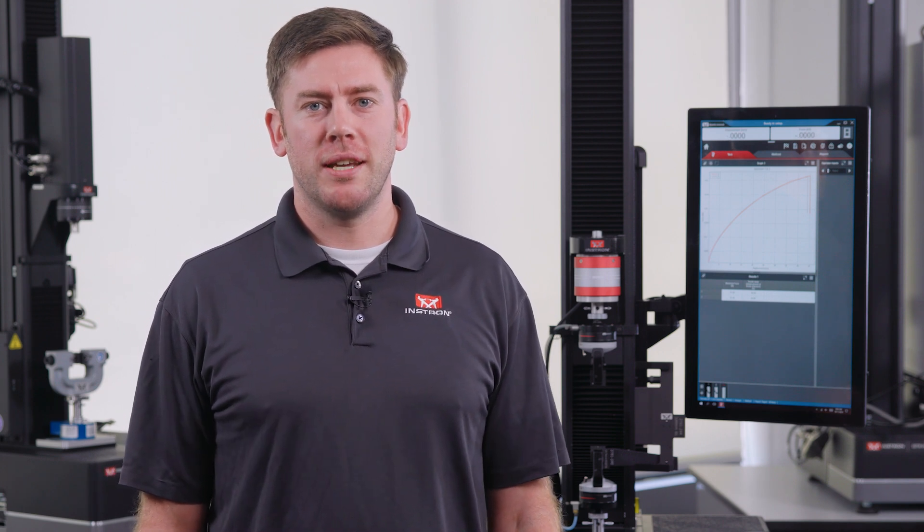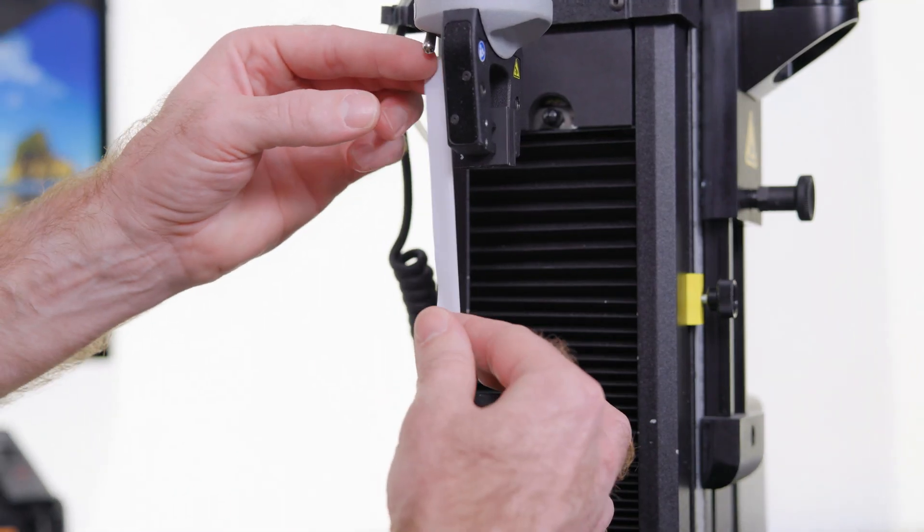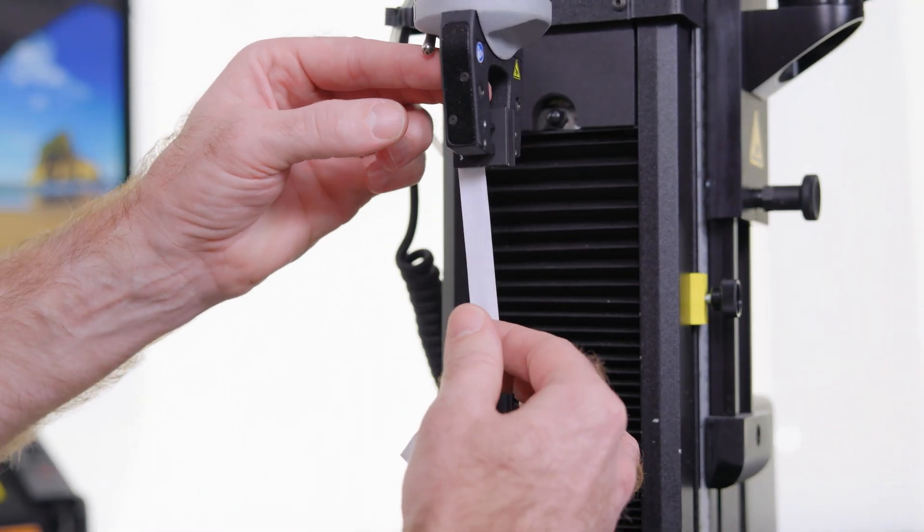Hi everyone, I'm Ian Kirk, Product Manager here at Instron, and in this video we'll be discussing how to test thin film and foil specimens, as these materials can be incredibly challenging to handle.